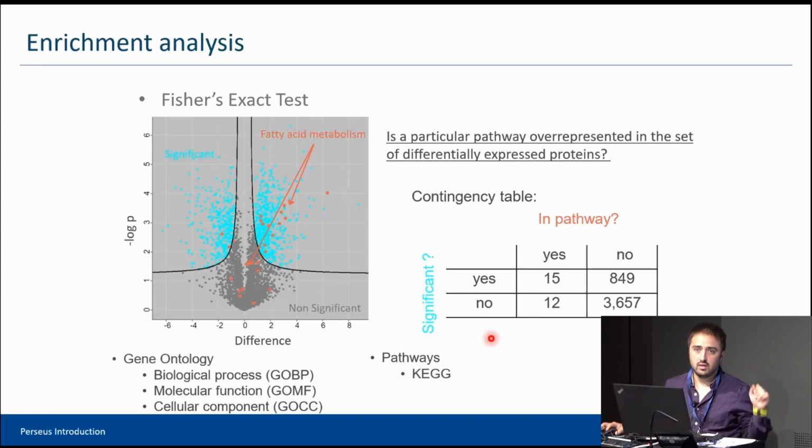a plus sign or a check mark when something is enriched or depleted, and we will also see how to do it later. But it's already implemented, right? So you don't have to do anything other than clicking on a few icons. Exactly.